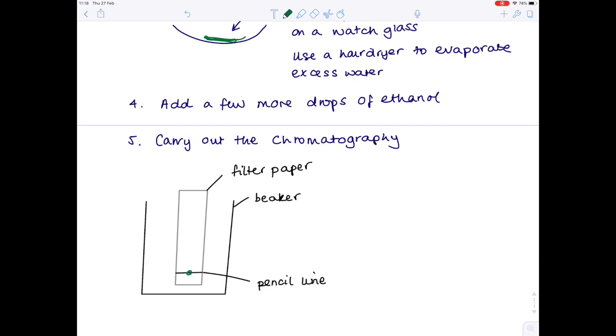Next up, add your photosynthetic pigments. You're almost ready to go now. You just need to add some running solvent into the bottom of the beaker, making sure that it's just below that photosynthetic pigment spot, but so that it touches the filter paper. At this point, because that running solvent will show a tendency of soaking up the paper, it will draw with it the photosynthetic pigment, and then we'll actually get our chromatogram.